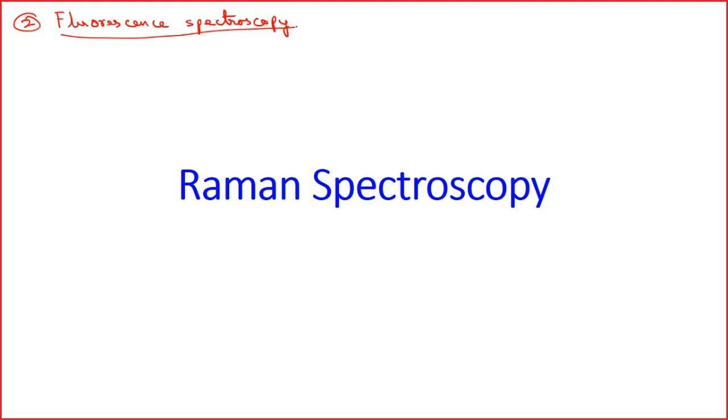Okay, fluorescence or phosphorescence, I am not separating them, as the principle is similar. So that was, we are basically looking into the luminescence property of the sample. Over there, we are again having the radiation source. Then we were having this monochromator. I'm writing it as MC, monochromator.